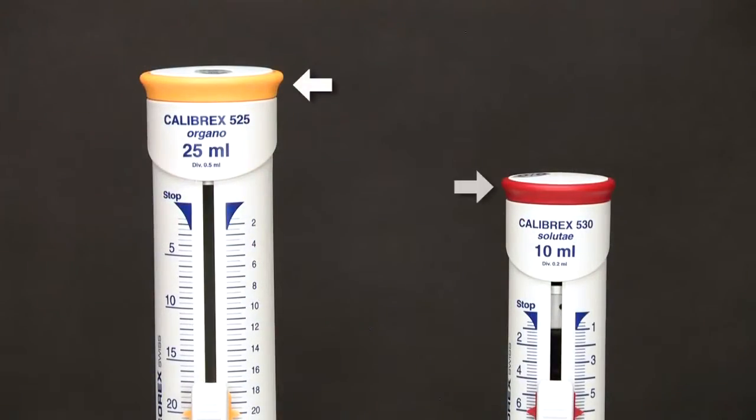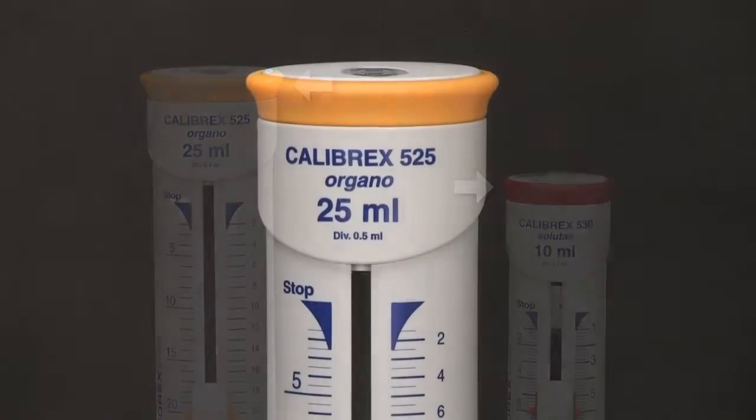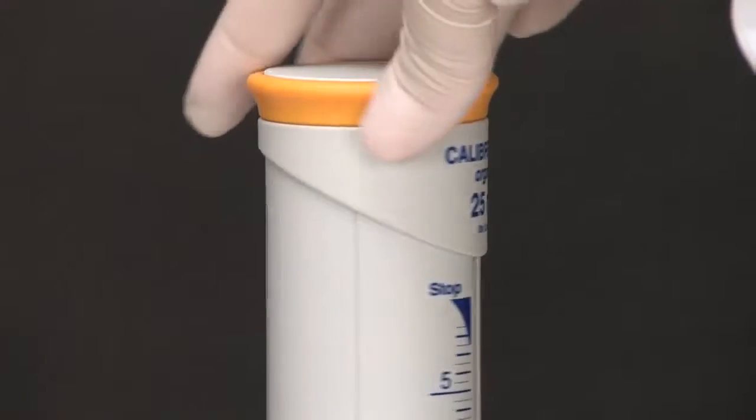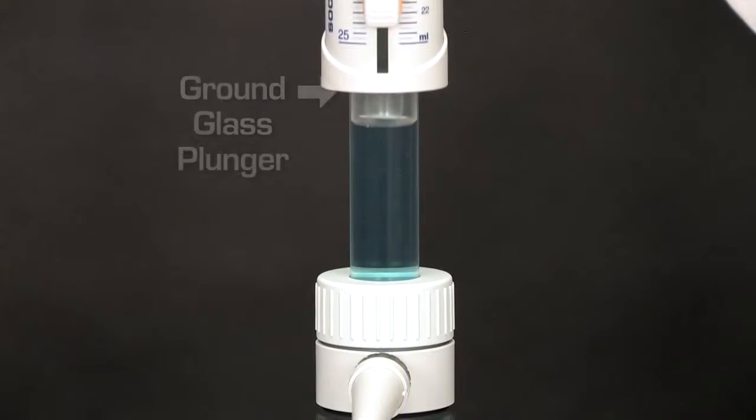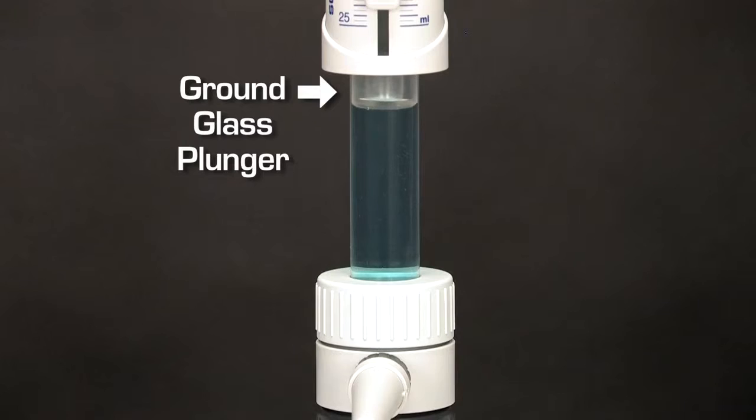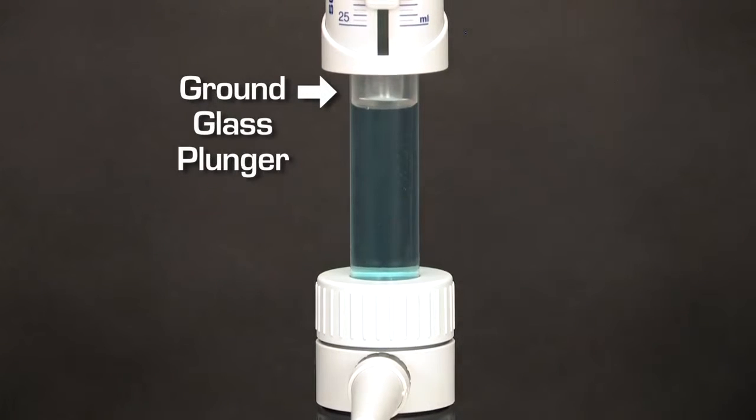Each of the two models is identified with a color code. The Organo model is best suited for organics, non-crystallizing acid, and base solutions because of its ground glass plunger. Models up to 10 milliliters have a ceramic plunger.